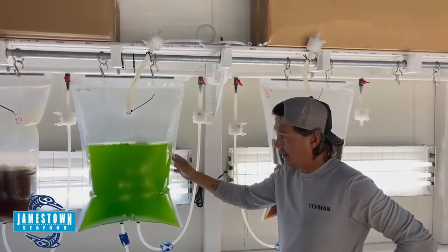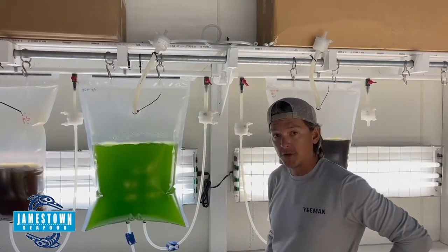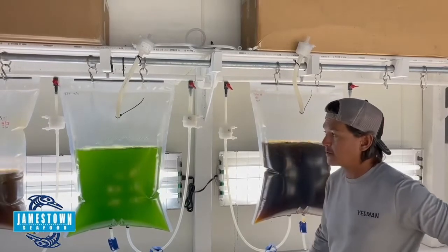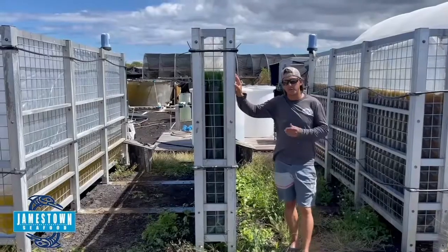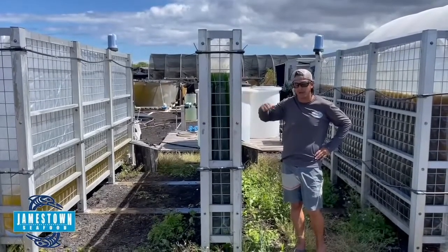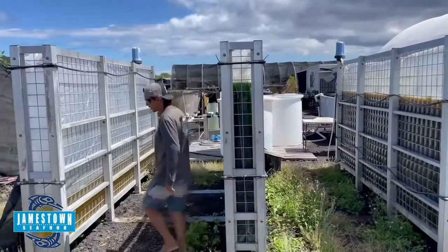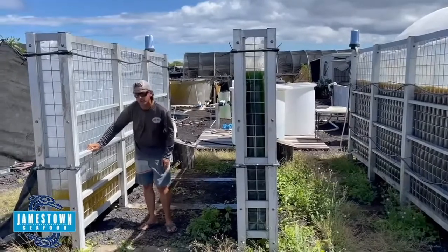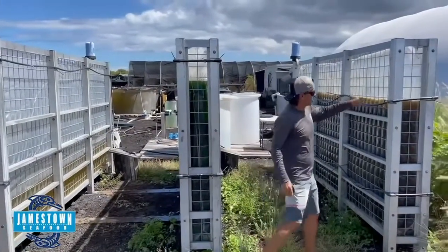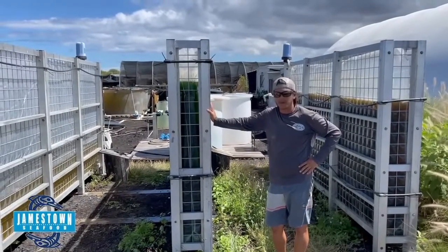This is a brand-new culture of Tetraselmis, and by the time it comes up to density next week, it'll almost look jet black in this bag. Primarily we use these to inoculate the 1,350-liter systems outdoors, but once we're done doing that, these bags can also be used to fill carboys or back-start other types of tanks we run on a day-to-day basis. Here's a more pulled-back view of our 1,350-liter bag systems. We usually get about four to six months out of each bag, and we like to inoculate them about a month apart from each other so we get a good spread when we have to change bags. If one goes down, we have two more operating. That rotation has become really an essential part of running our hatchery farm.